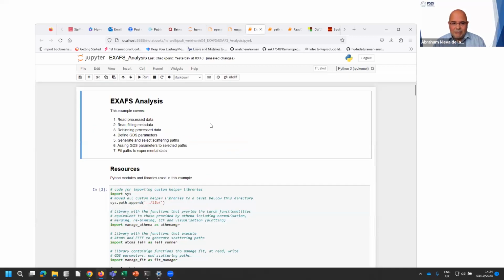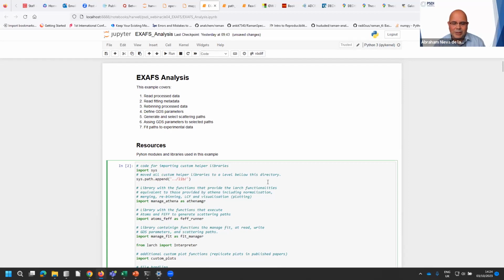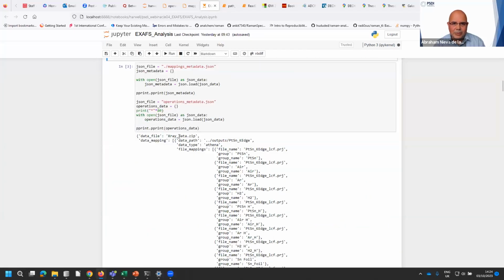In this case, maybe you will tell me off for doing something that I don't know is correct for EXAFS analysis, but let me show you the example and then we can talk later. It's the same thing. First, we load the libraries. We wait for the libraries to load.